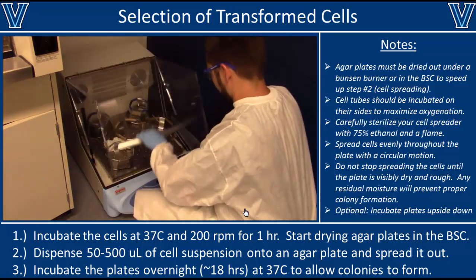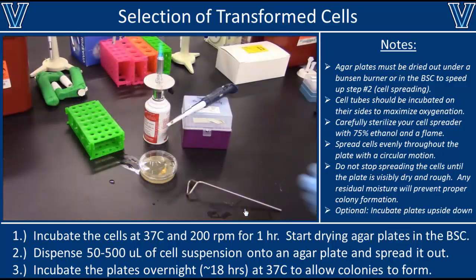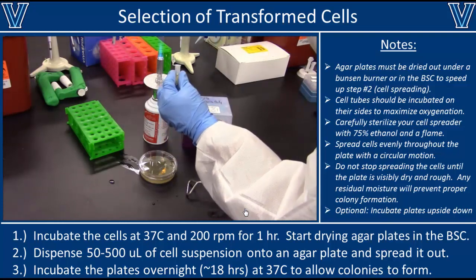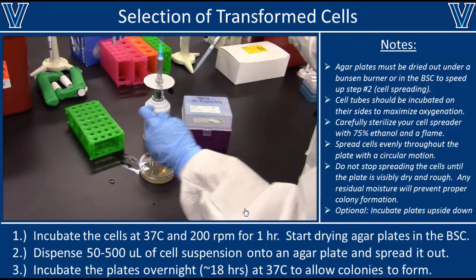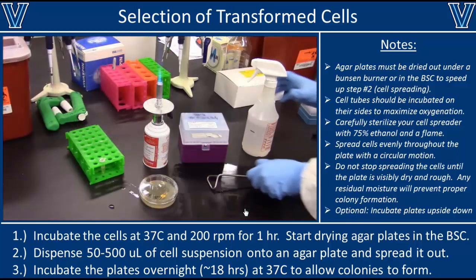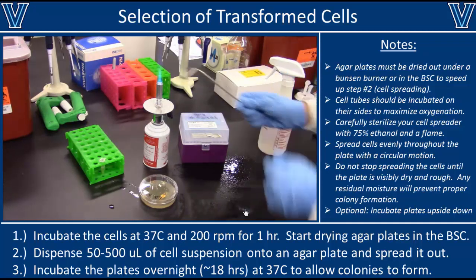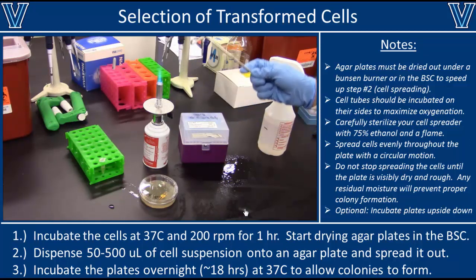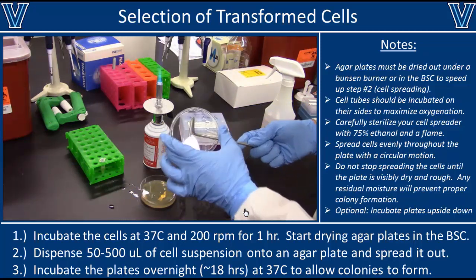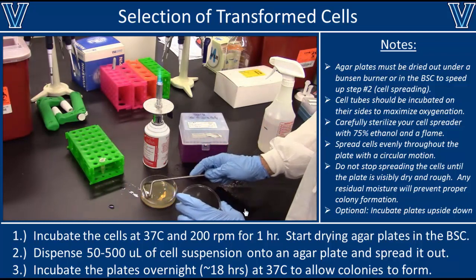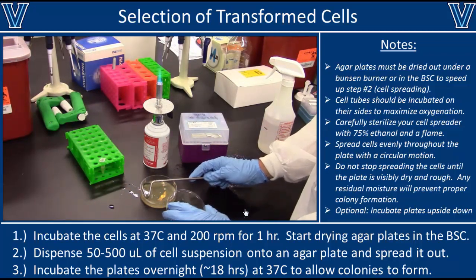Once the incubation step is over, remove the cells from the incubator and bring them back to the sterile bench. Add some cells to your agar plate — if using a ligation reaction you'll probably want to add all of them, but if using an intact plasmid you can add as little as 50 microliters. To spread the cells, use a cell spreader like the metallic one shown here. Spray it with ethanol and let the ethanol burn off, then let the cell spreader cool — a hot spreader will kill all of your cells. Wave it in the air a few times and touch it to the top of the plate to check for steam.